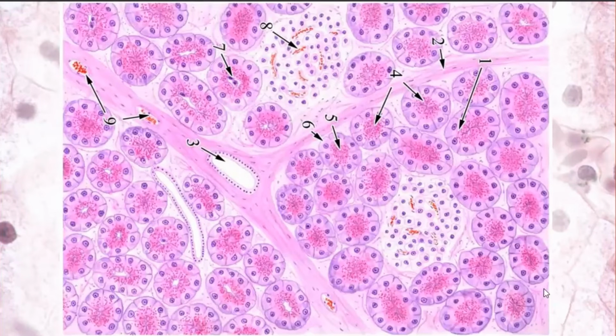And here we can see drawing of histological slide. There are acini. Here we can see them. Their basal poles are homogenic. They contain rough endoplasmic reticulum and nuclei, and they are violet in shade. And apical poles of the cells, they contain granules with zymogen, and those granules are pink in their staining, and that's why central parts of the acini also are pink. Also, we can distinguish here some ducts, intralobular ducts inside the lobules.